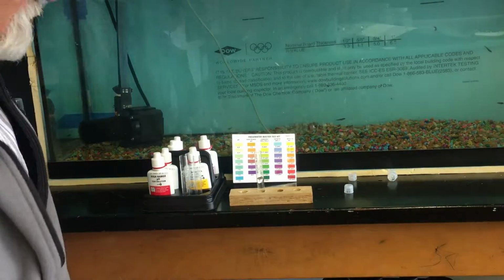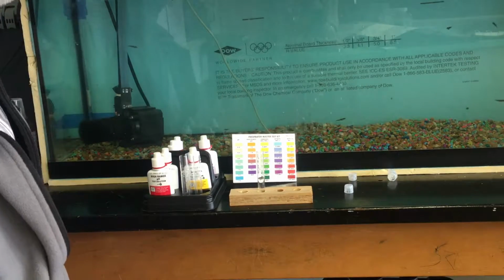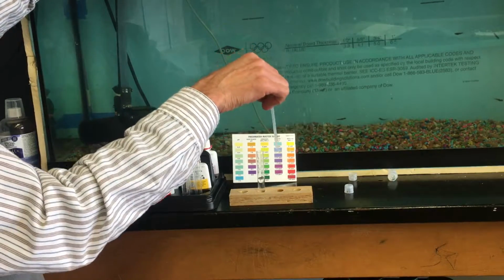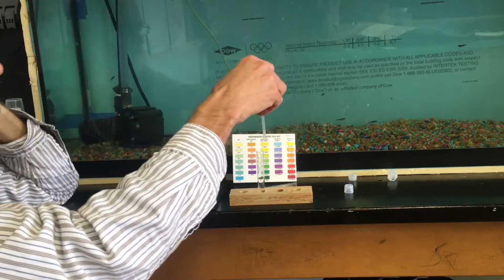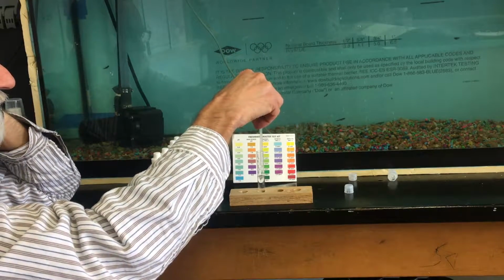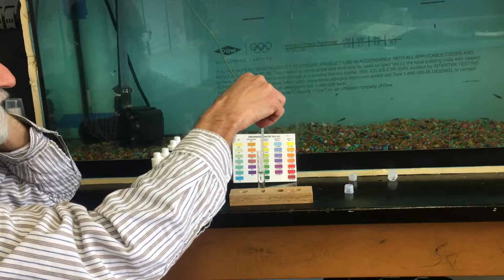So we start with a clean, dry test tube. I've already pre-filled this one partially with water, and we fill the test tube using a pipette. Draw water out of the tank using the pipette so that we don't put our hands in the tank, because we can have dirt or material on our hands that will be detrimental to the fish.